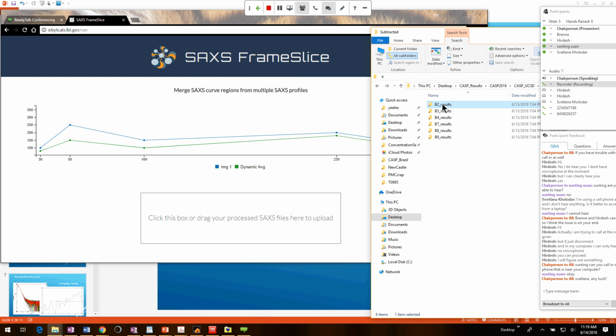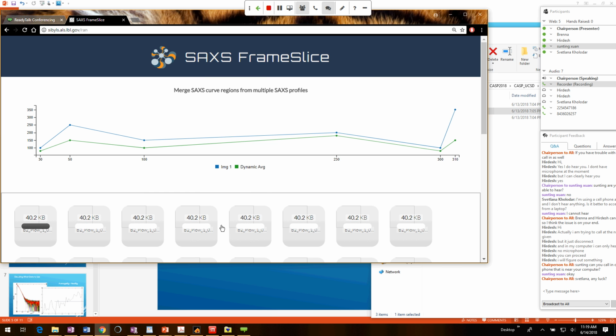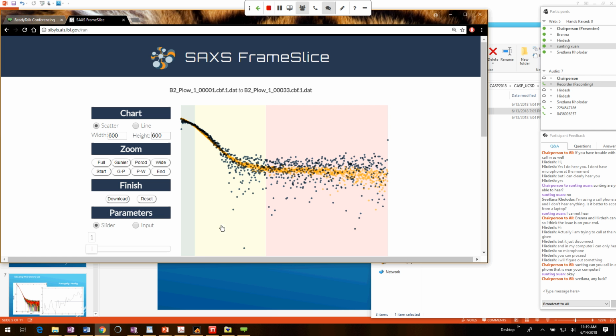So I'm going to go to this first one. I'm going to pull buffer 1 down, and you just drag the whole folder over. And again, you guys are probably mostly Mac. How you drag and drop is a little different, but you can drag the whole folder in. And so this is a scattering curve. It's the first low concentration of the sample. And it's separated into 3 different regions: a Guinier region, a Porod region, and a wide Q region.